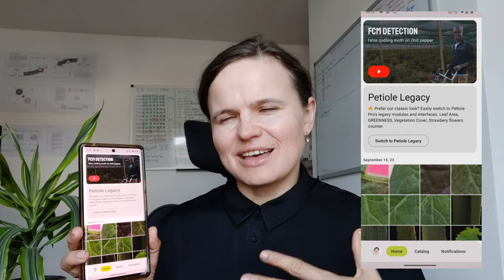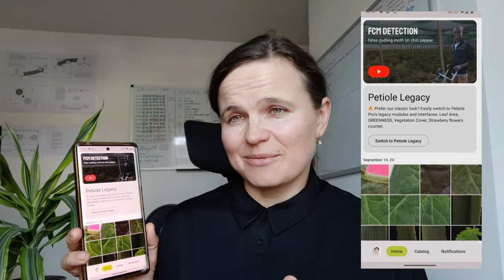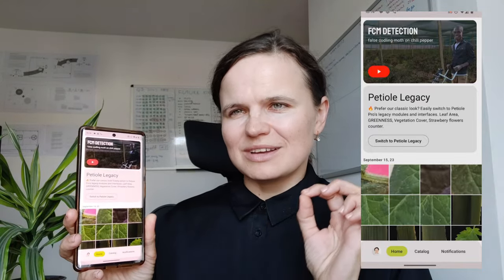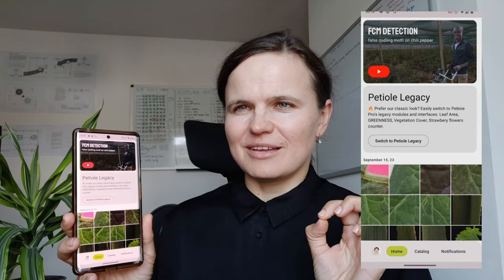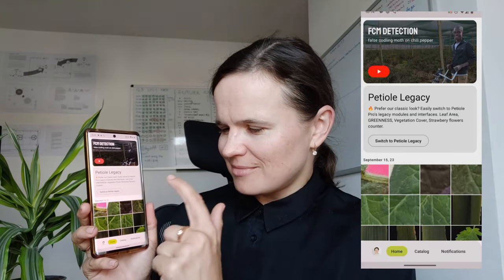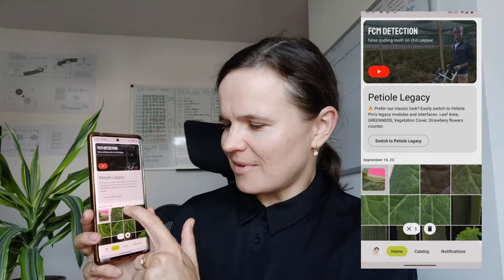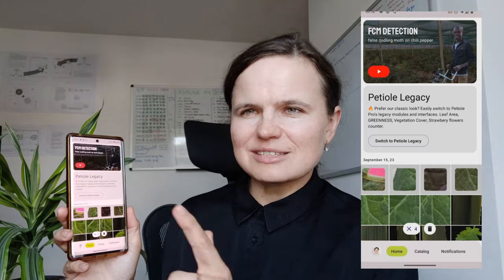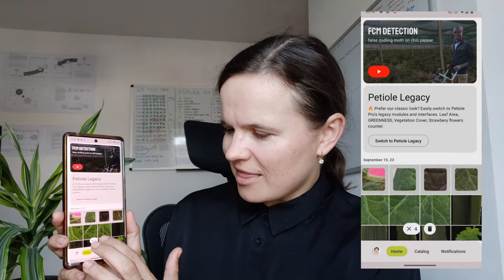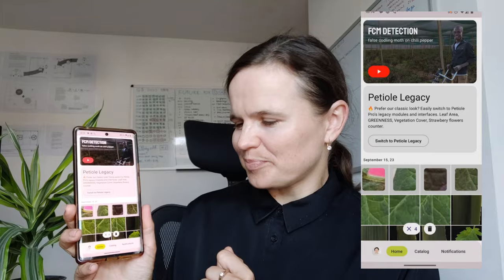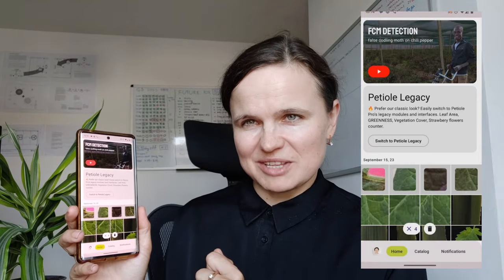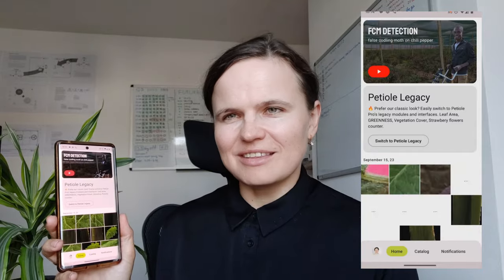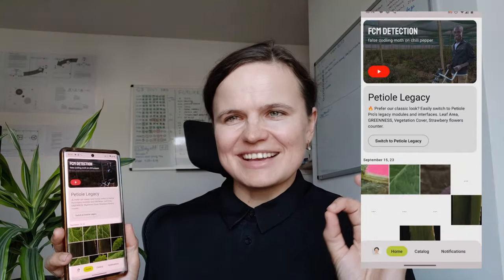One more very helpful practical thing: if you have many measurements and need to delete some, all you need to do is tap and hold one, then tap and hold more — as many as you wish. You will see the number of measurements that will be deleted. If you agree with that number, press the button and they are deleted.